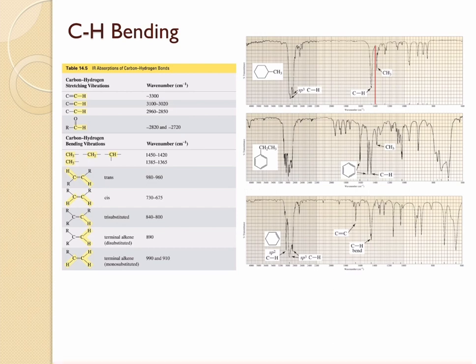The CH bending vibrations of hydrogen that is connected to the sp2 carbon is going to come somewhere between 1000 to 600 centimeter inverse. But these numbers can really fluctuate depending upon the number of R groups present in the molecule. Also, these numbers can go out of range if there is a very strong electron withdrawing or electron donating group attached to the molecule.